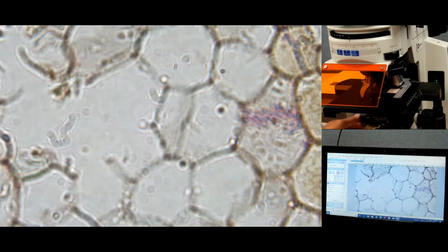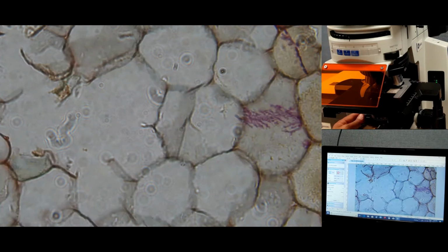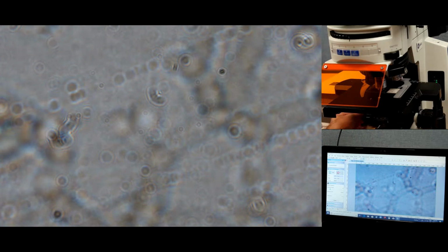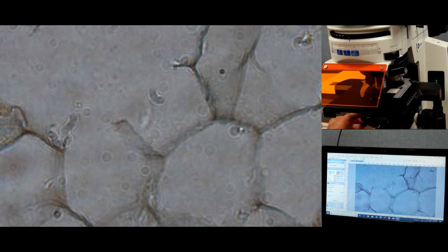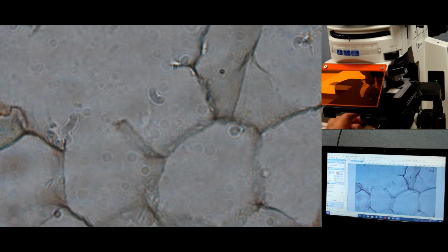We switch to 60x, which has 0.85 numerical aperture. Next is 100x oil, but I'm using it without oil in this step, just to show you how the image looks in air mode. Obviously the sample will not be in focus everywhere.